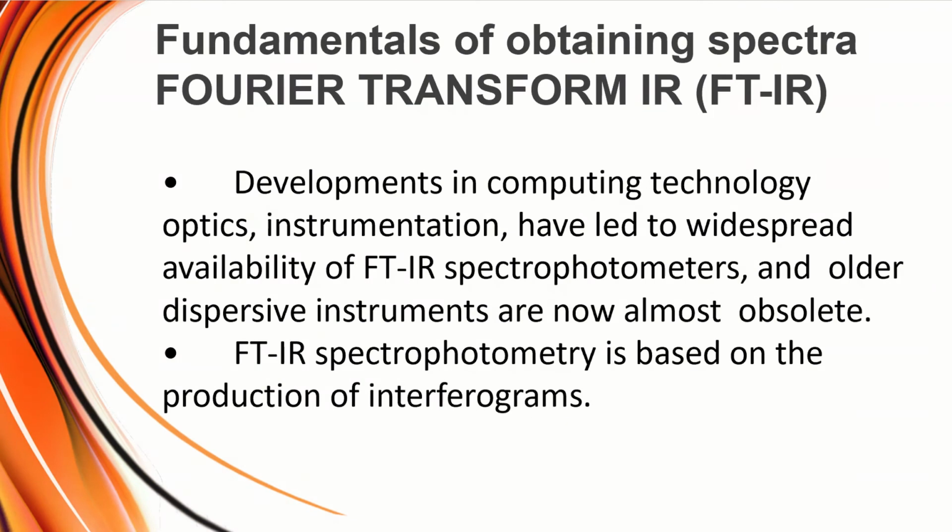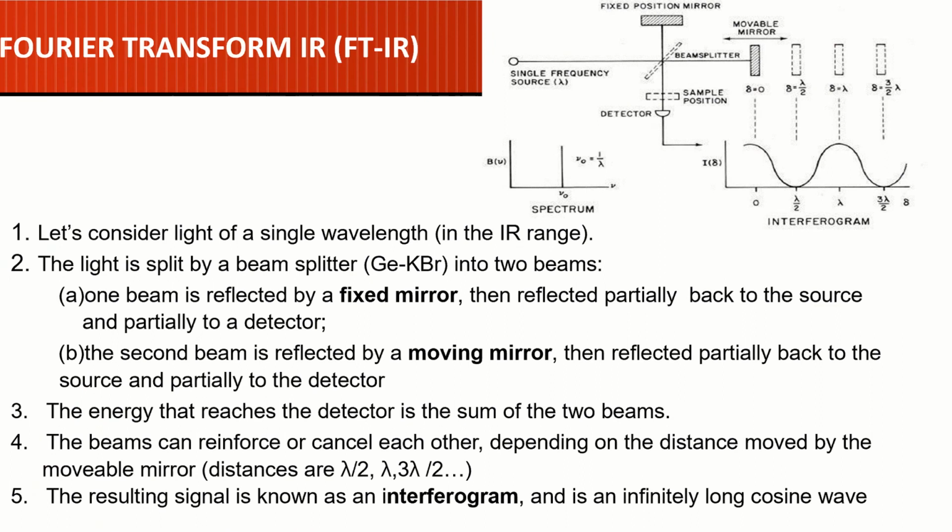Bear in mind that we just want a general understanding of the instrumentation we use to produce this spectrum. We're not going to go in depth into the Fourier transformation or interferograms and those types of things. So this is an image here of the setup, and I'm going to walk through it slowly.